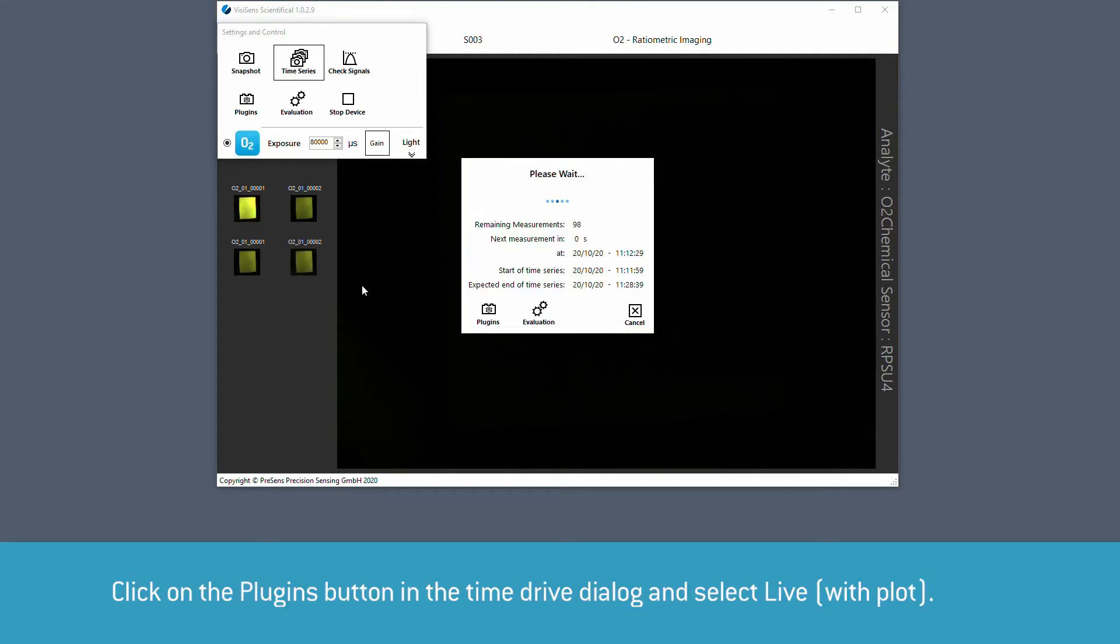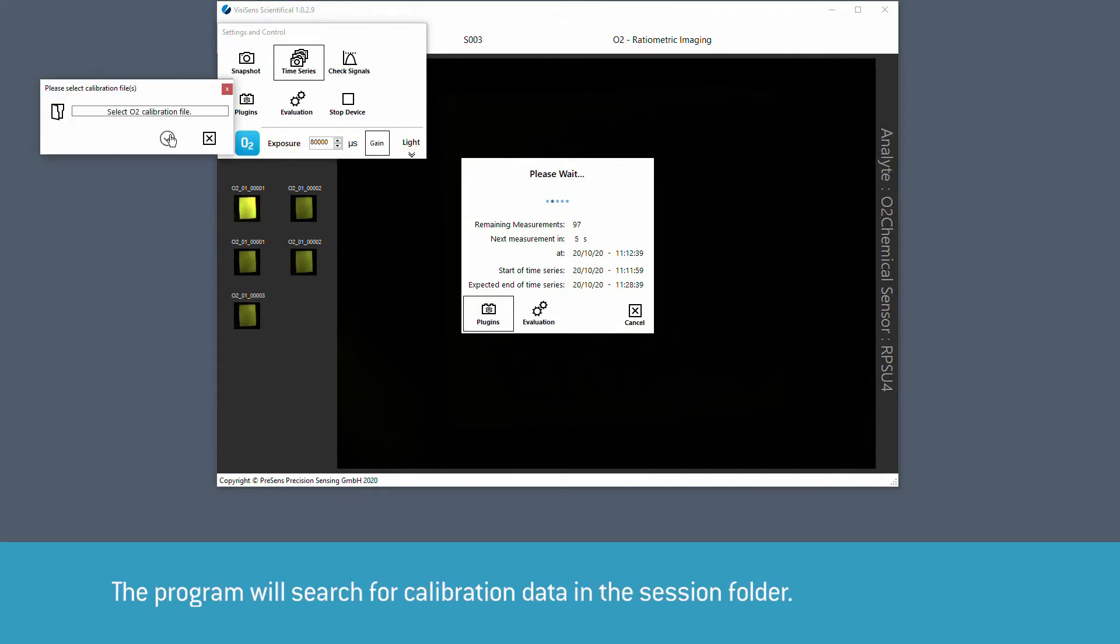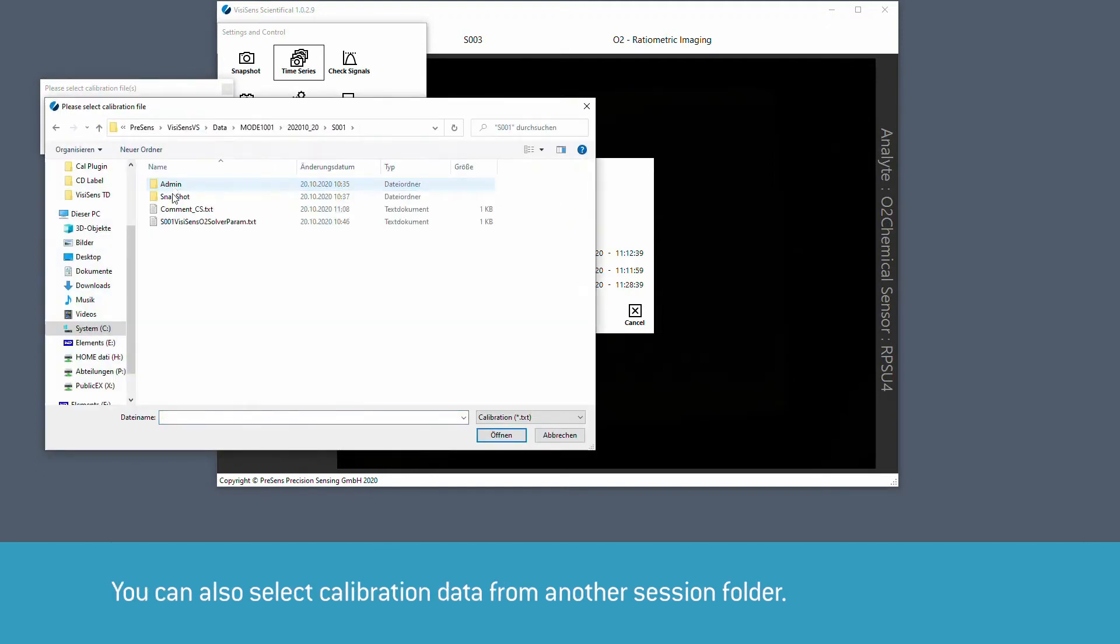Click on the plugins button in the time drive dialog and select Live Plot. The program will search for calibration data in the sessions folder, but you can also select data from another session.